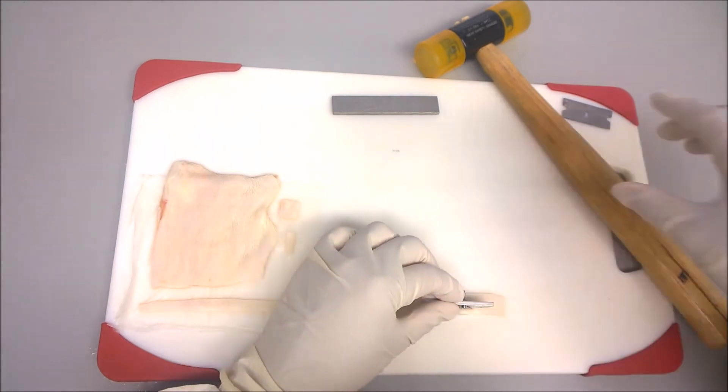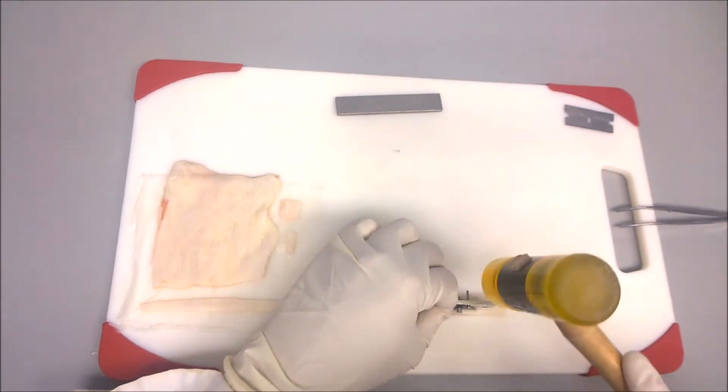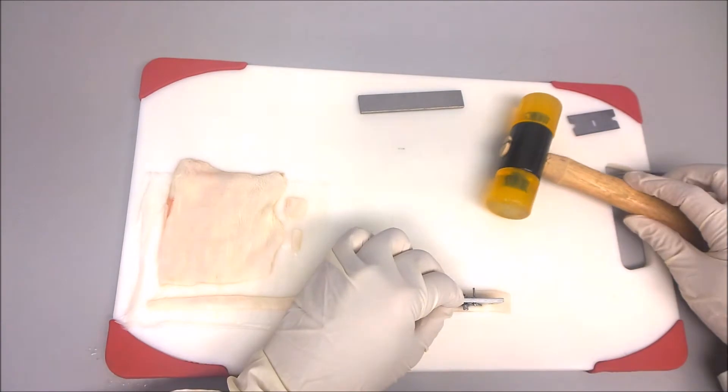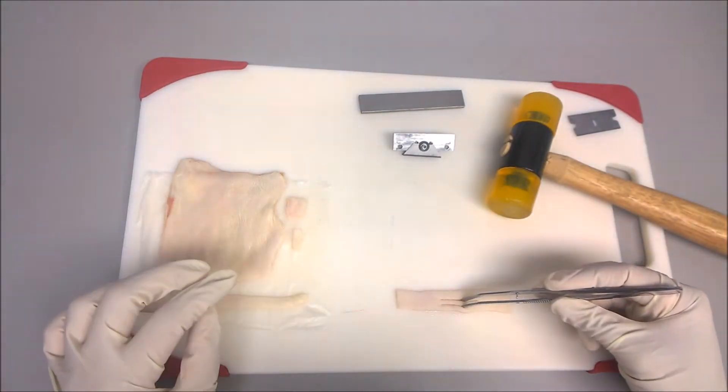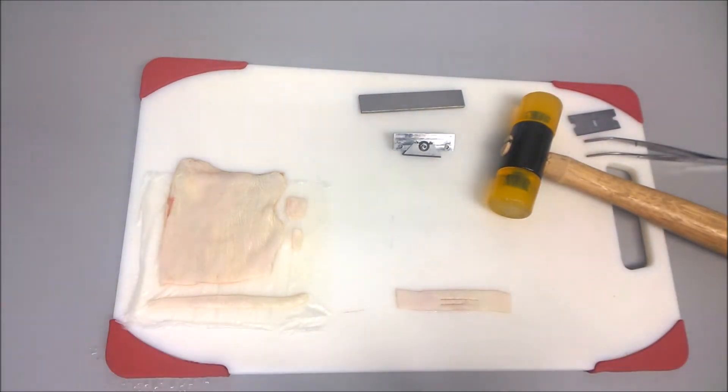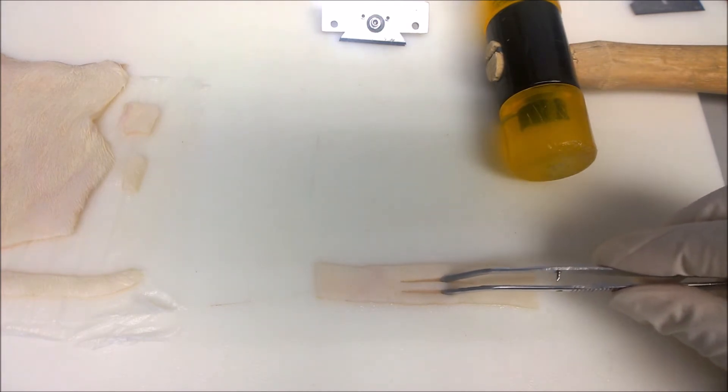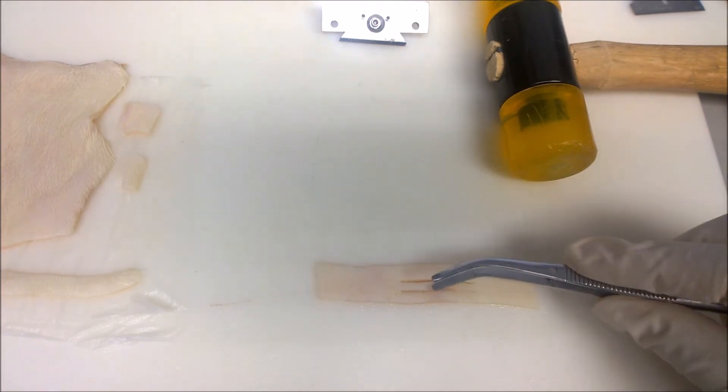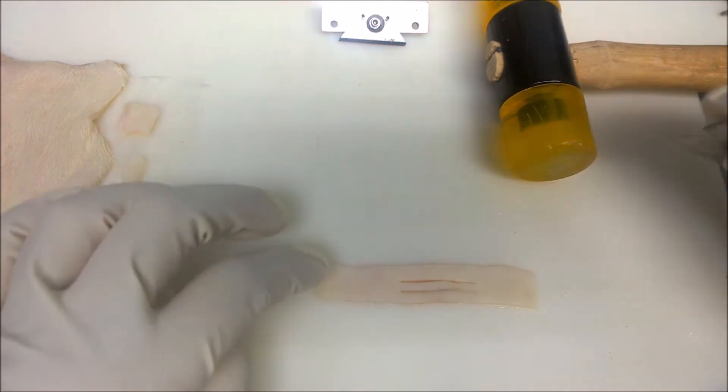Then center the cutting die on the skin to make the middle cut. Firmly hold the cutting die in place and use the mallet to cut through the skin. Use a sufficient force to cut the entire section.